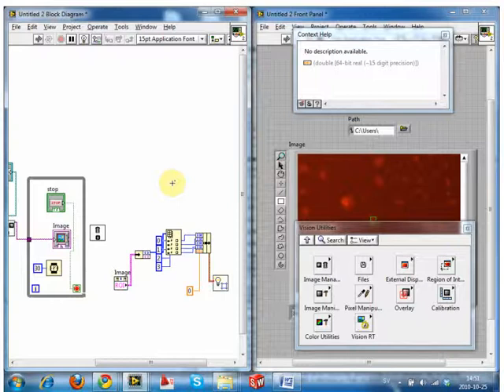You have this one open? And it goes in vision. Okay. You just have to make it step. Then you get this view thing here.